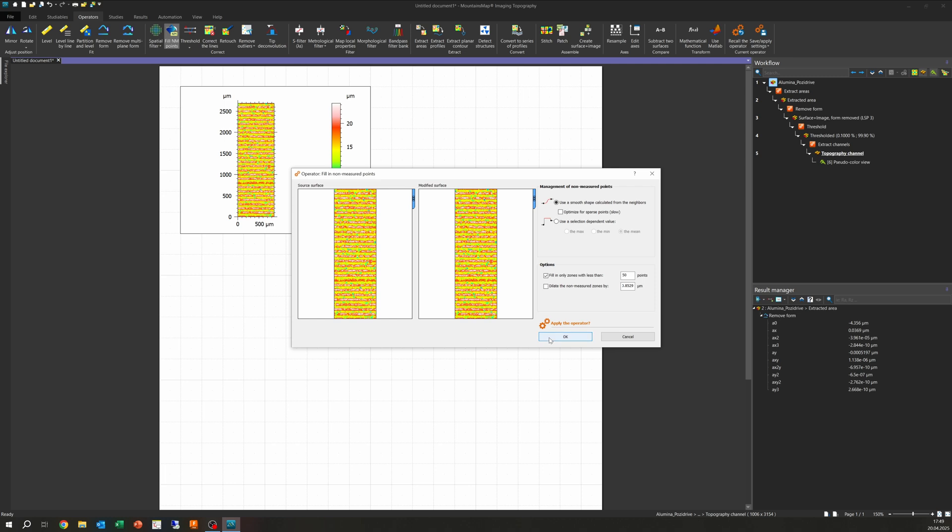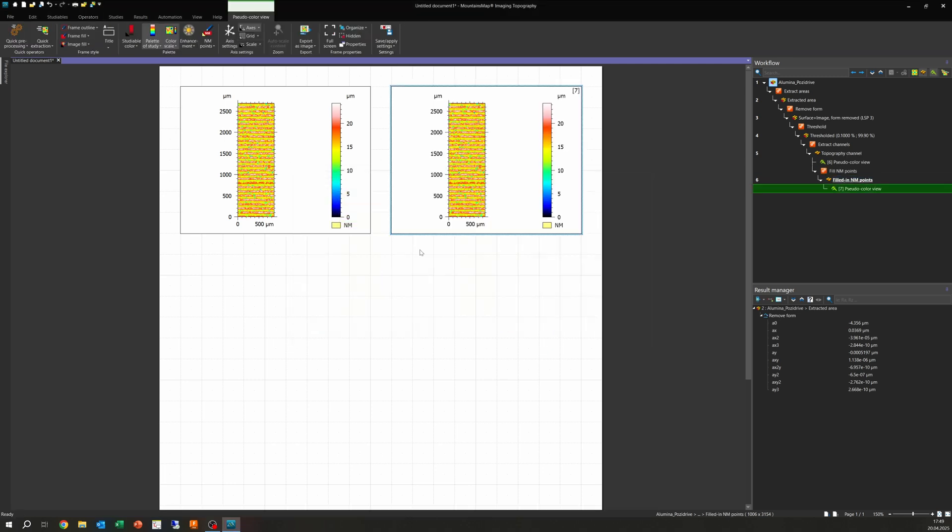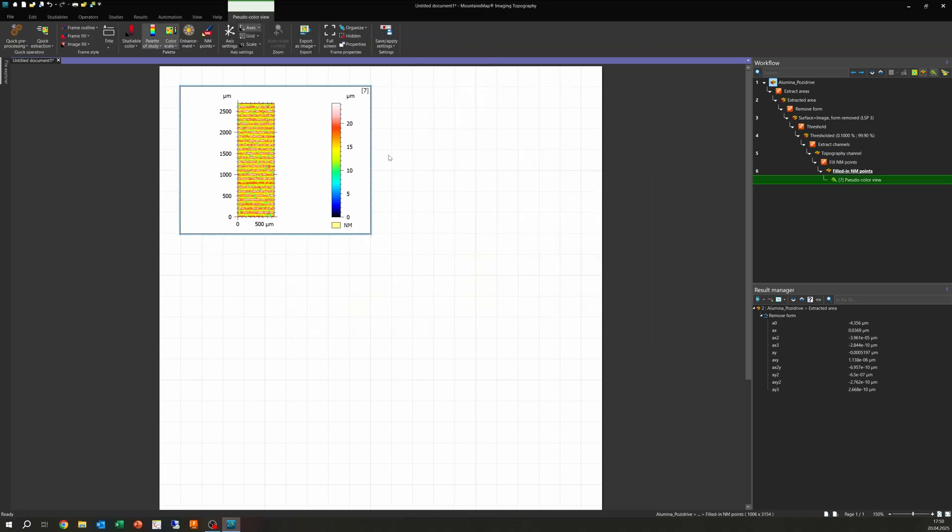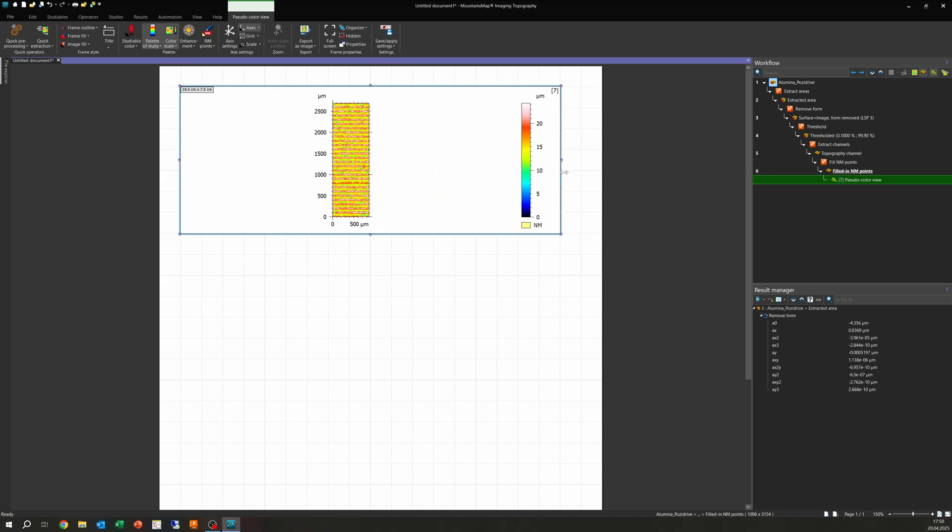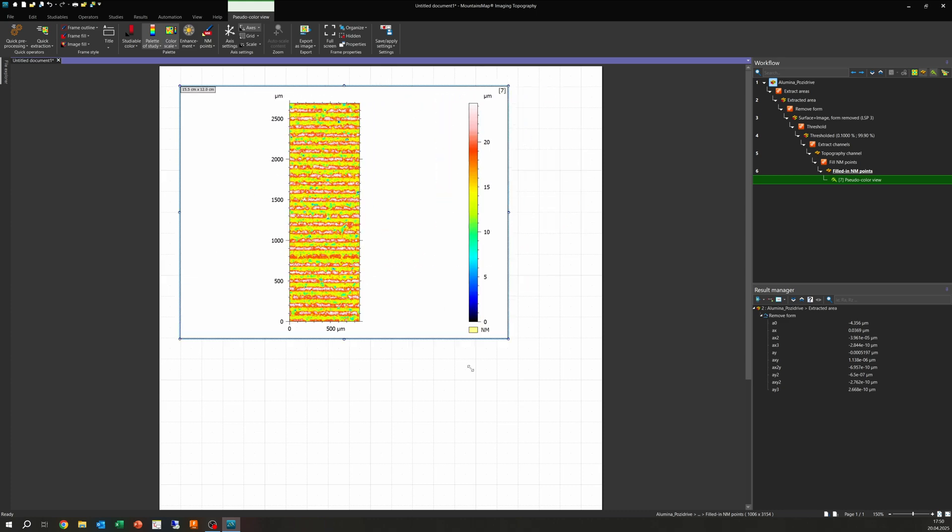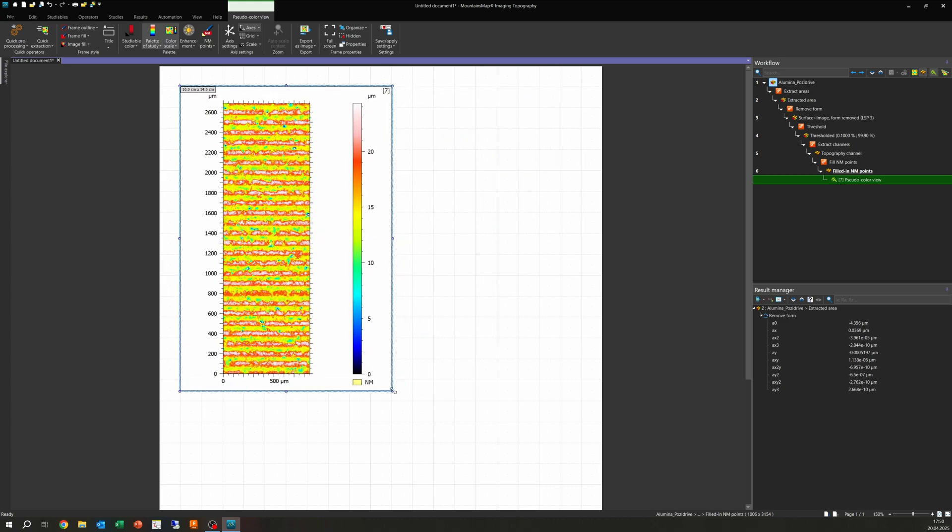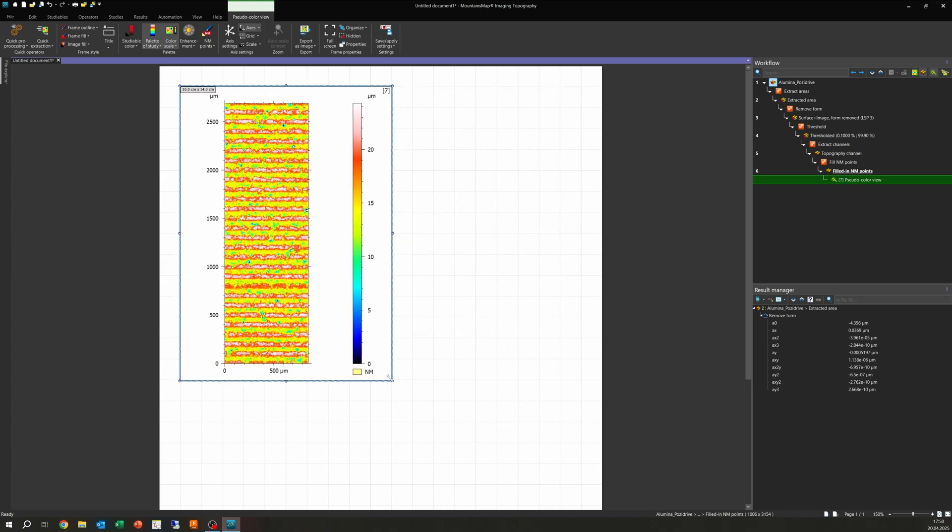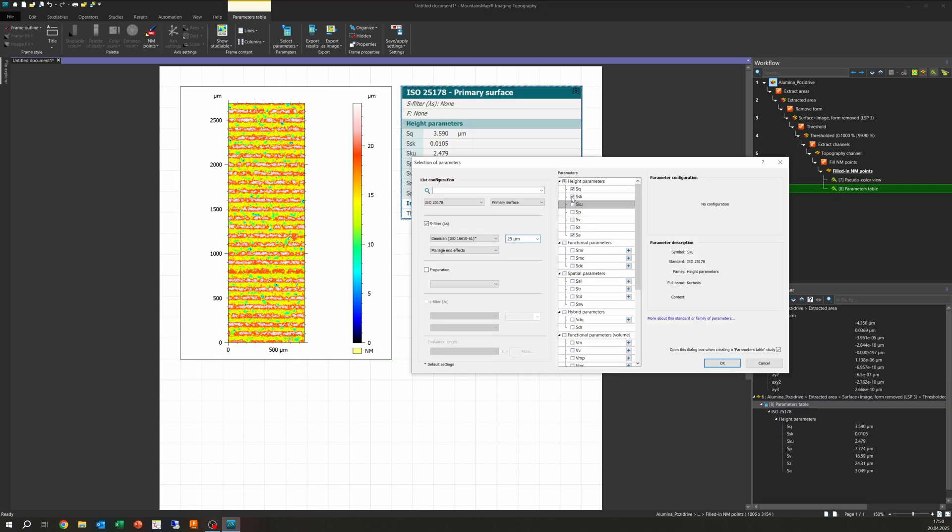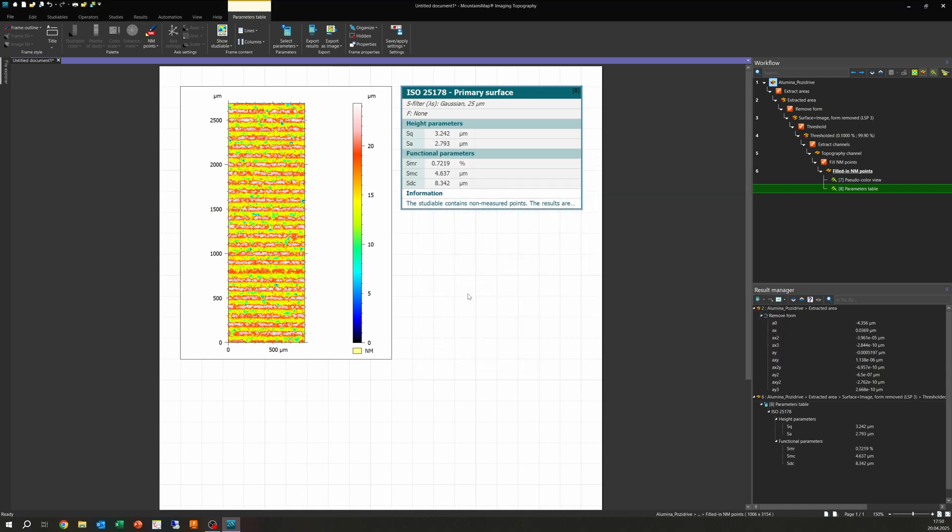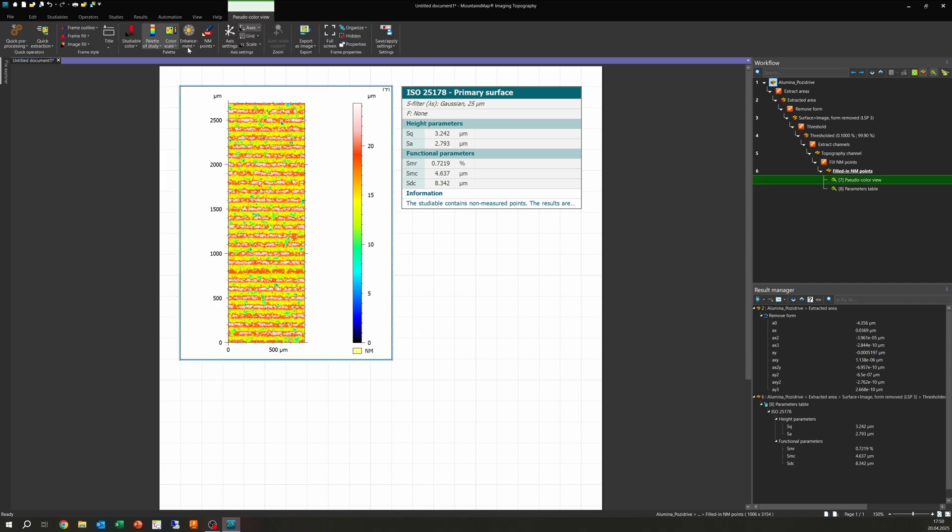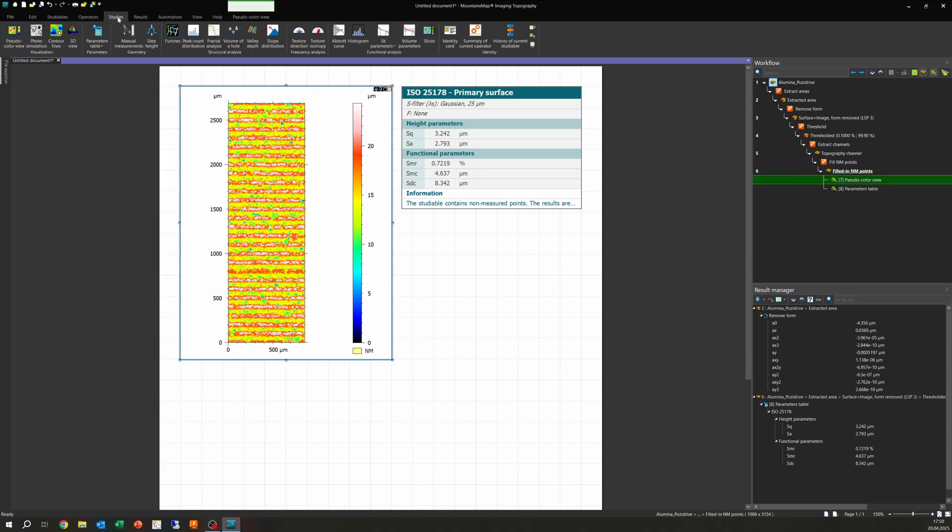With this flat, even, cleaned-up surface, we can now calculate some surface parameters, such as SA, the arithmetic surface roughness, or SQ, which is the RMS of the surface roughness. I'm also including some functional parameters, such as SMR, which is the material ratio. The resulting surface shows a surface roughness SA of 2.79 micrometer, so pretty much what I expected.